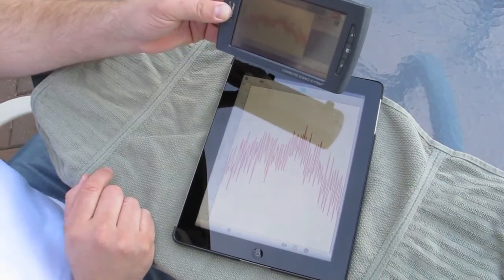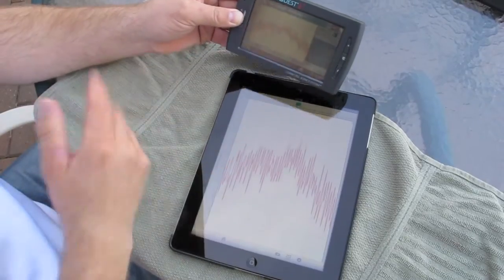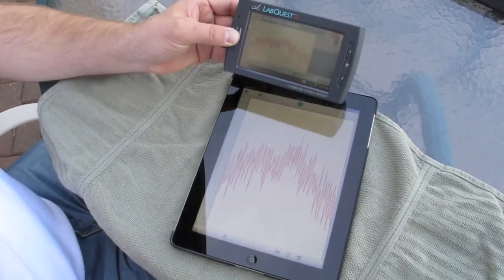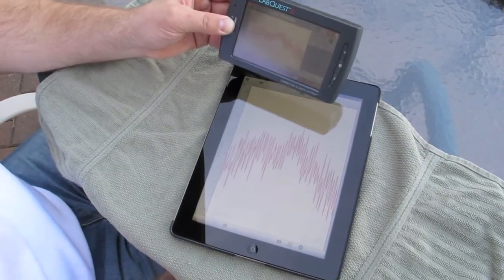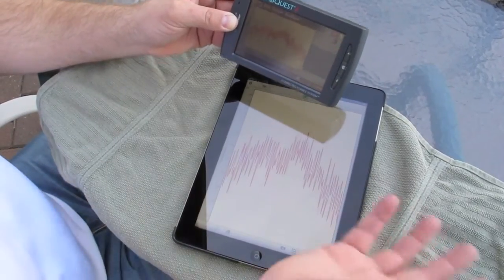Yeah, pretty neat. I mean, imagine having a bunch of devices connected to it, and kids could just think about doing a demonstration, and instead of just watching it, they're engaged. David said, car ride. Yeah, exactly. I was actually thinking about what things you could do, because you have a GPS, you have accelerometers in there. The field trip could be the bus, kids. So, in a nutshell, this is kind of it.